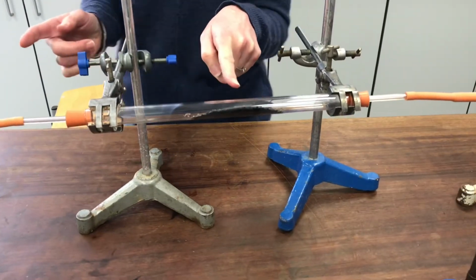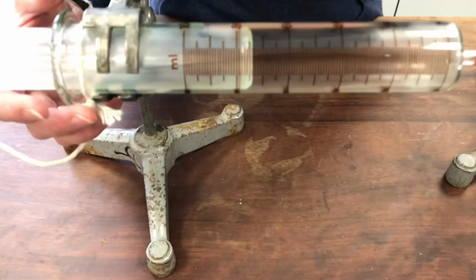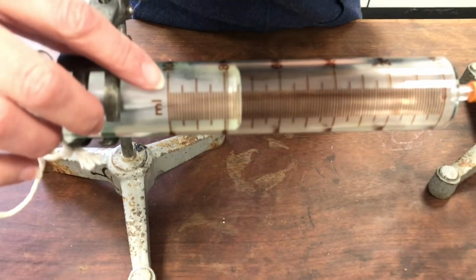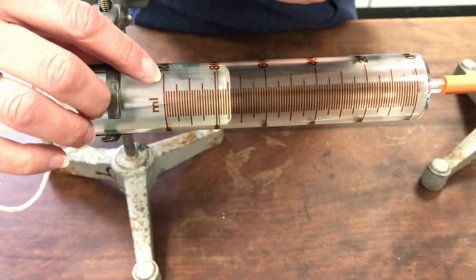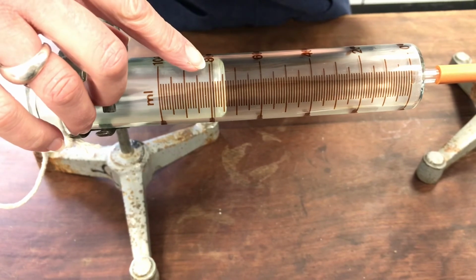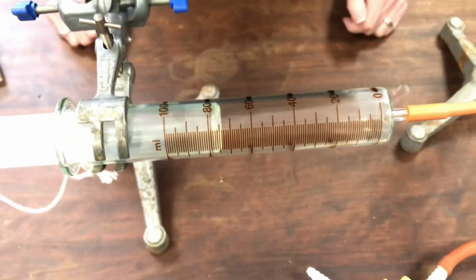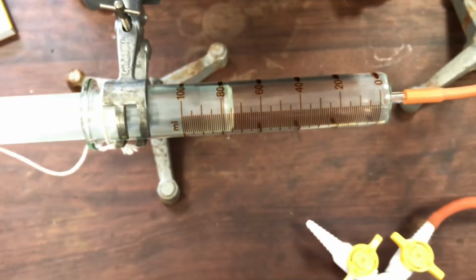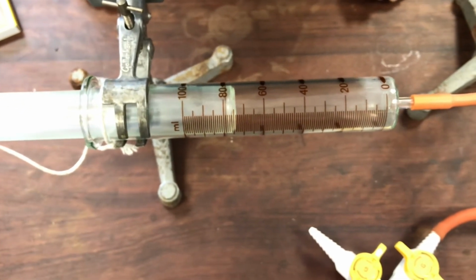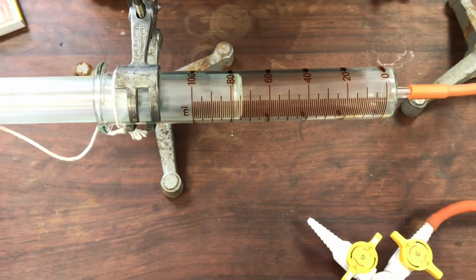And the other thing I wanted you to have a look at is this gas syringe over here. So now that everything's cooled down, you might be able to take a reading. It started at 100 millilitres here, and you can see that the volume I've got now in my system is much smaller. Okay, so if you can take a reading from that yourselves, you should be able to calculate the percentage of oxygen that was in the air. That difference in volume is due completely to the oxygen that was in the mixture at the beginning.